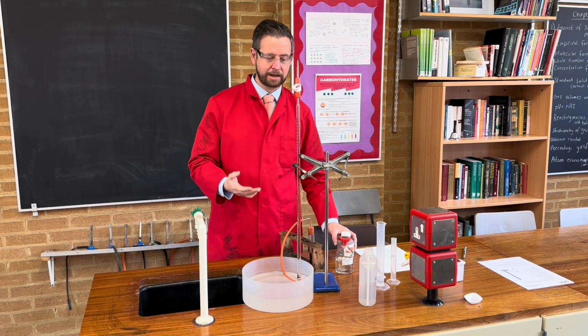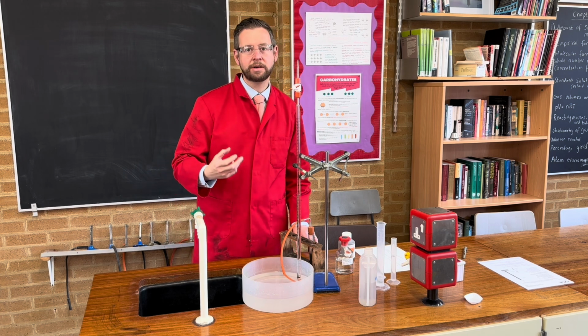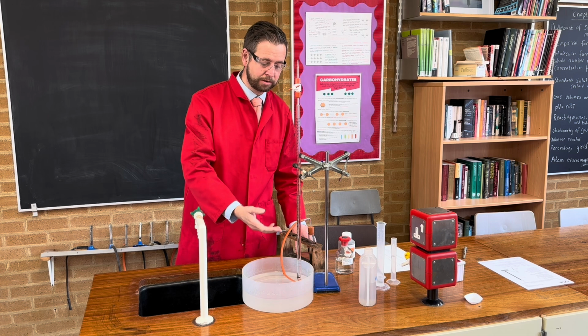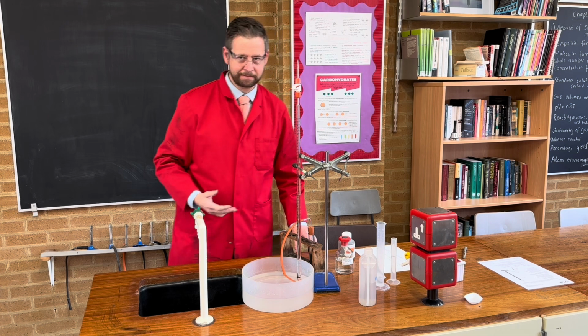The apparatus is going to be an accurate gas collection. So rather than just doing a gas collection into an upturned measuring cylinder, we're going to run it into an upturned burette. Now to see how we set this up, keep watching.